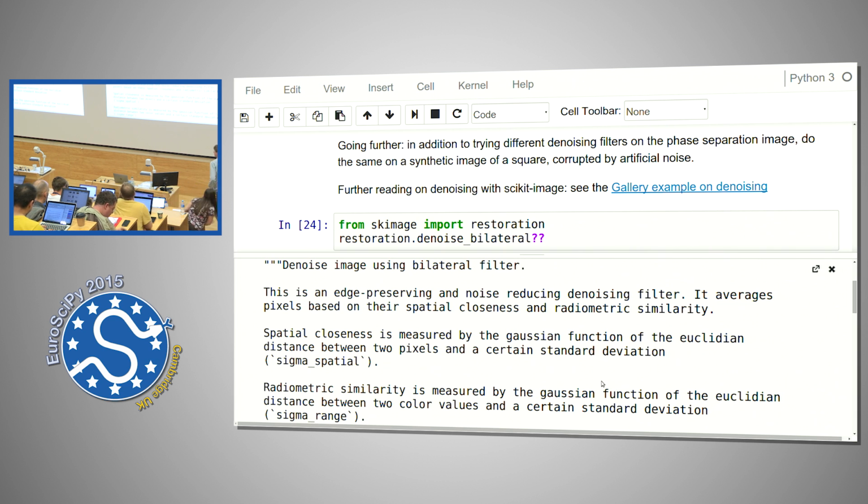Oh, I think it's because you didn't launch the IPython notebook from the root of the directory. Can you launch it from not lectures but one level above? And then it should be okay. CD, yeah. Then do it again. It should be okay. So does it need to be there in order to load all images properly? Is there a specific reason why? Oh, it's the way the IPython notebook handles paths, because they're relative paths, not absolute. Okay. It's not loading again.